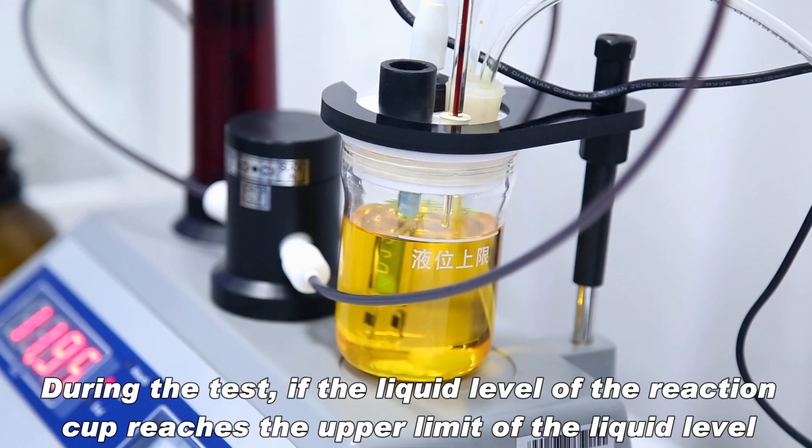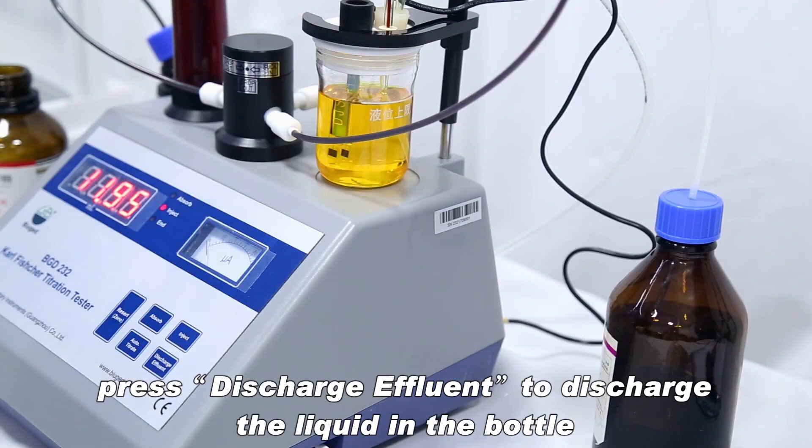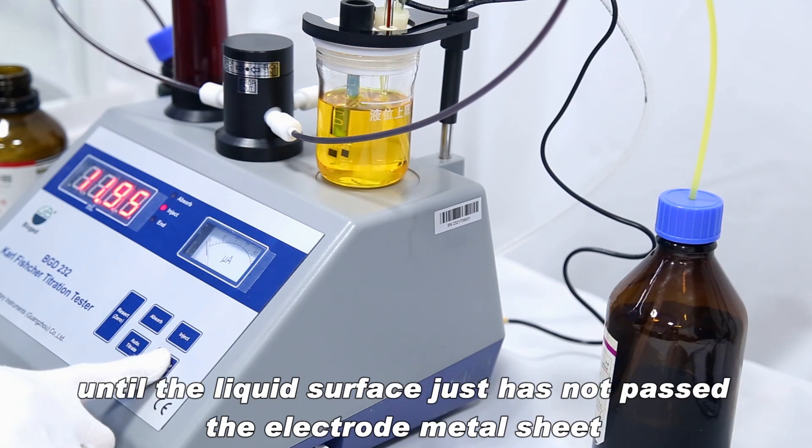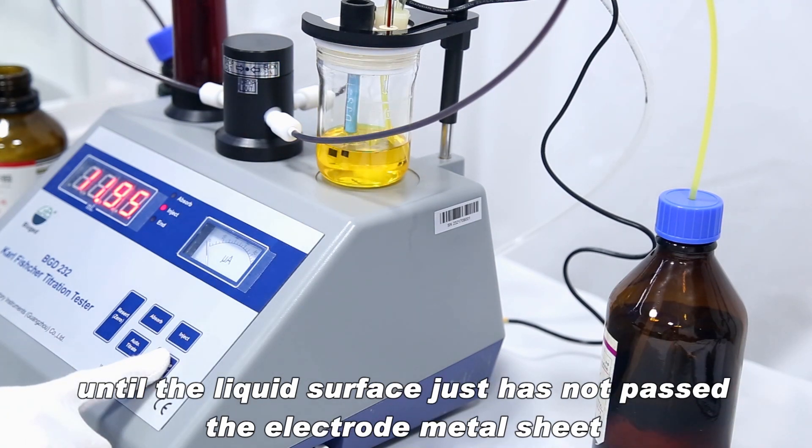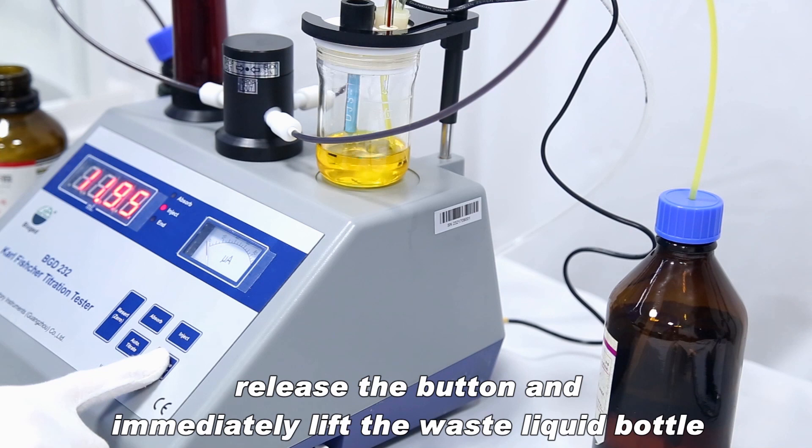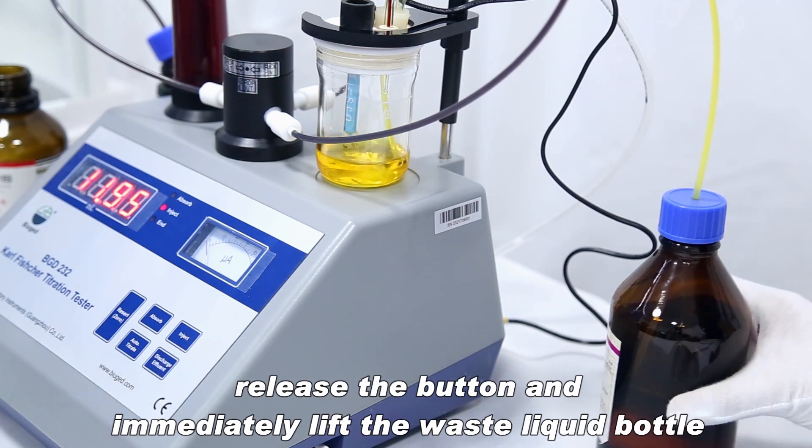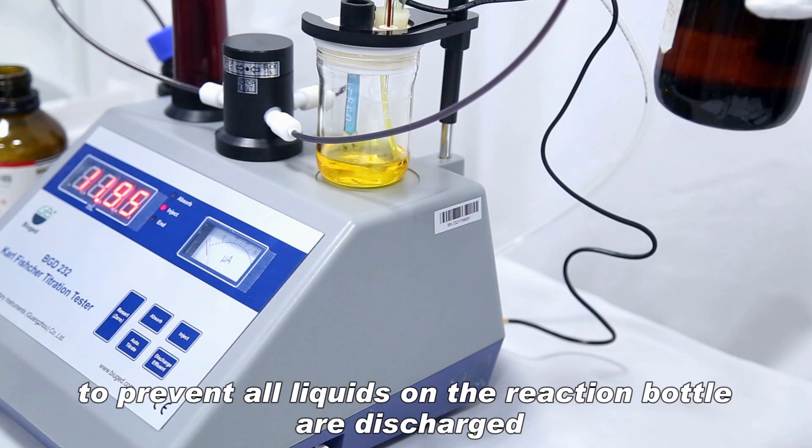During the test, if the liquid level of the reaction cup reaches the upper limit of the liquid level, press discharge effluent to discharge the liquid in the bottle until the liquid surface just has not passed the electrode metal sheet. Release the button and immediately lift the waste liquid bottle to prevent all liquids in the reaction bottle from discharging.